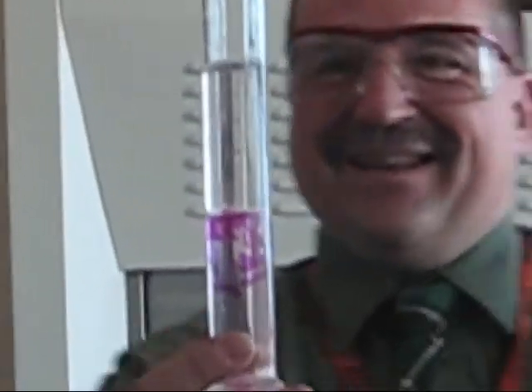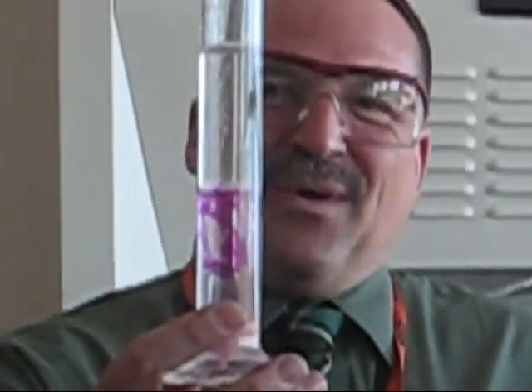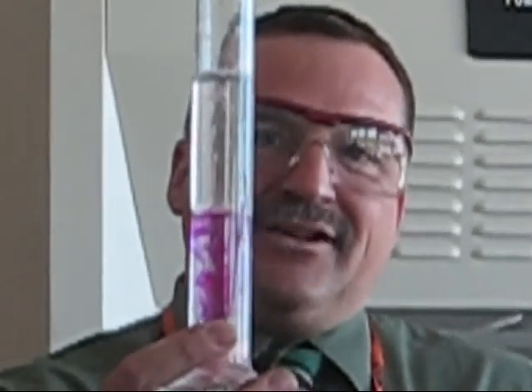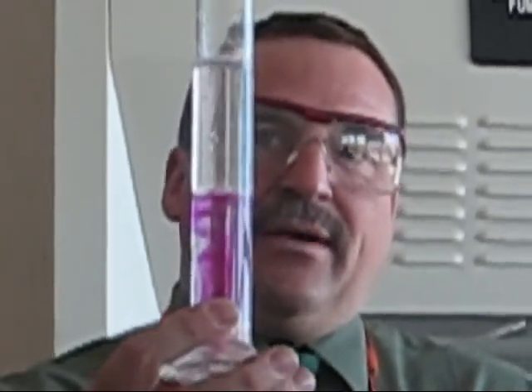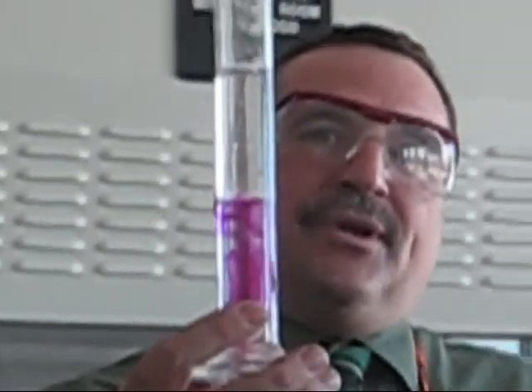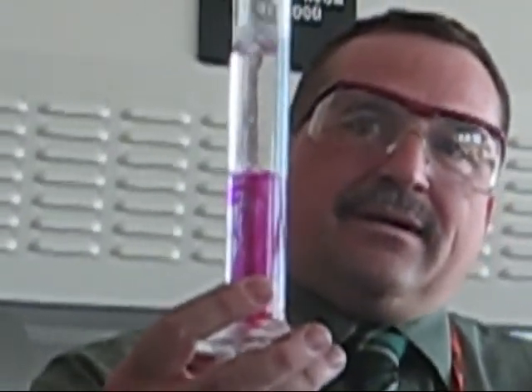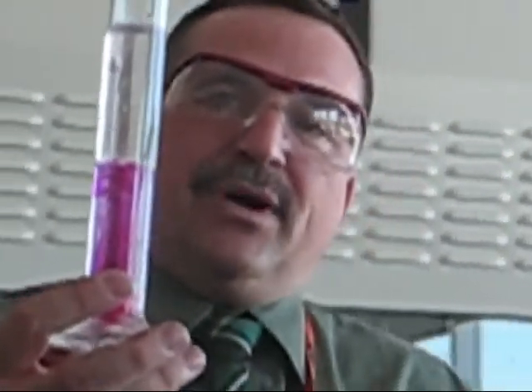It's swimming. What happened in the oil? Why? You said it's equal to the density of water. It's about the same, but it reacts with the water. What happens when it hits the water? Do you see the little bubbles? Yeah, it releases hydrogen. Right, and the hydrogen bubbles actually stick to it, and they buoy it up.